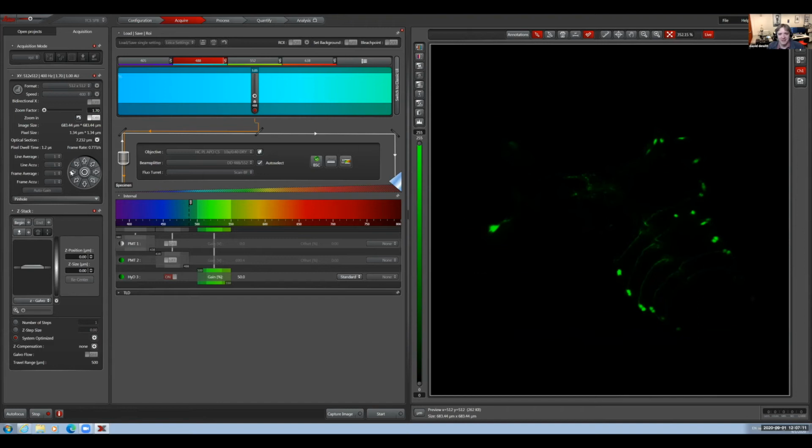Right. Okay. And I mean, the other thing is if you're only interested in a small portion of what you see, you don't have to spend the time to collect pixels everywhere else. Right. Only put pixels on the exact feature that you need. Is it only going to put the laser on those pixels too, so it won't bleach other pieces? Yep, exactly. Cool.